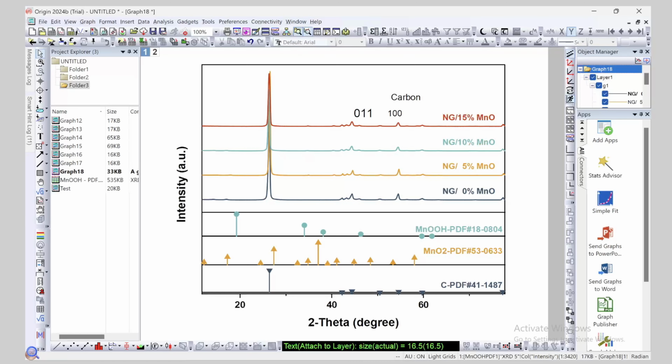This new Origin is good, and it also covers most of the basic fundamental applications of Origin, like how to plot this, and this template library is very good. Also, it has moved some options from File to Data and Graphs and so on. But still, it does a pretty good job. And I think the template library is really good.